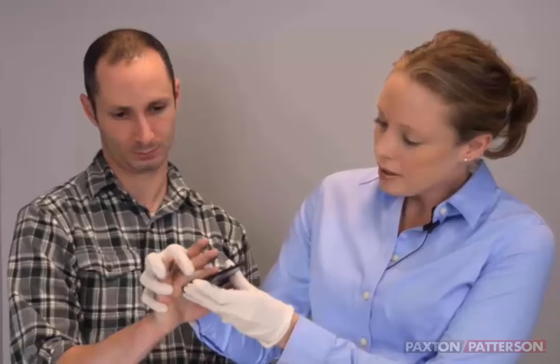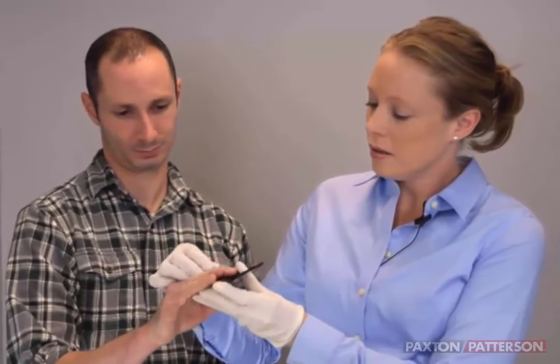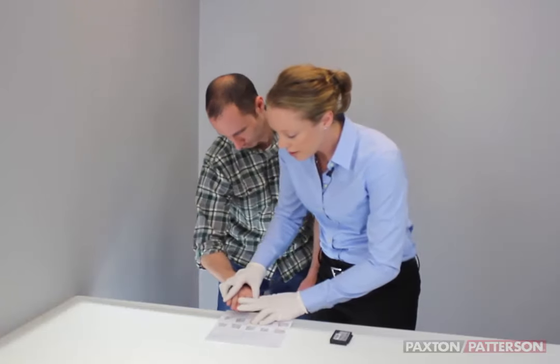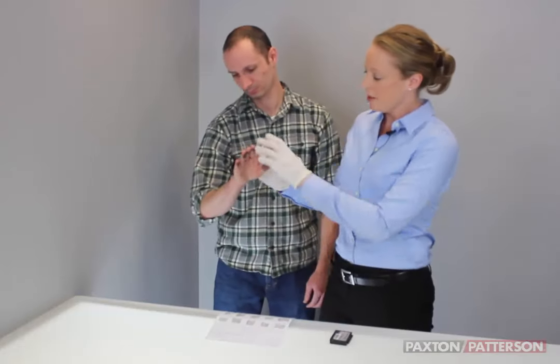We'll get a little bit more ink. You can see we have ink further down on the fingers this time, and we're just going to go straight down. I am going to apply some gentle pressure, and then straight up.